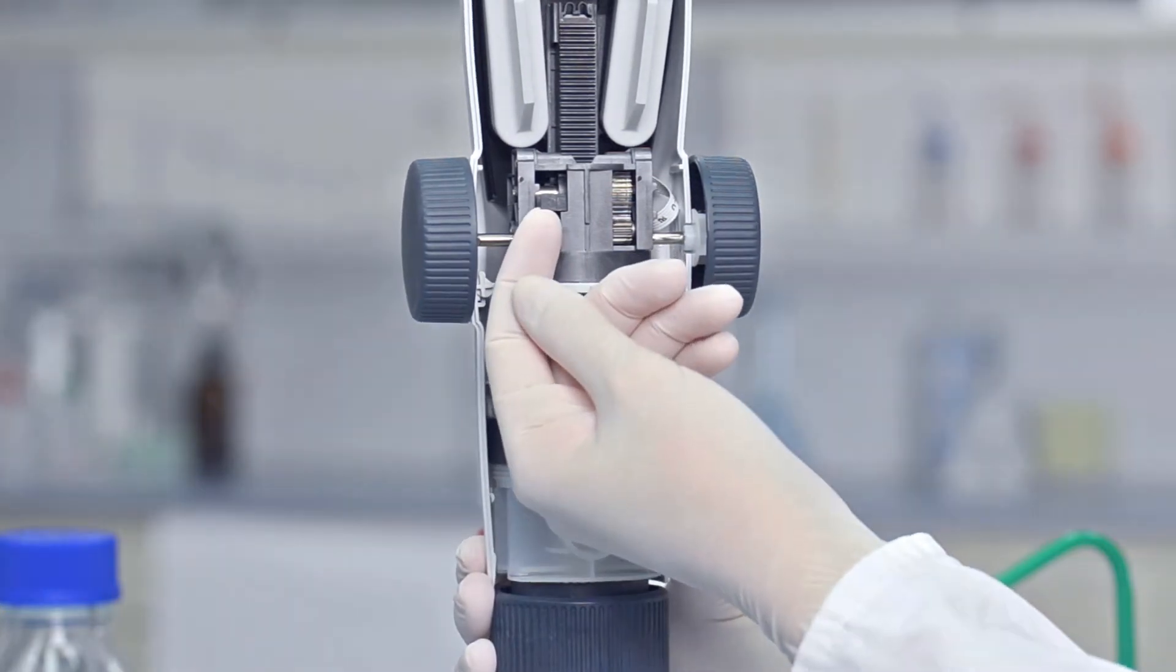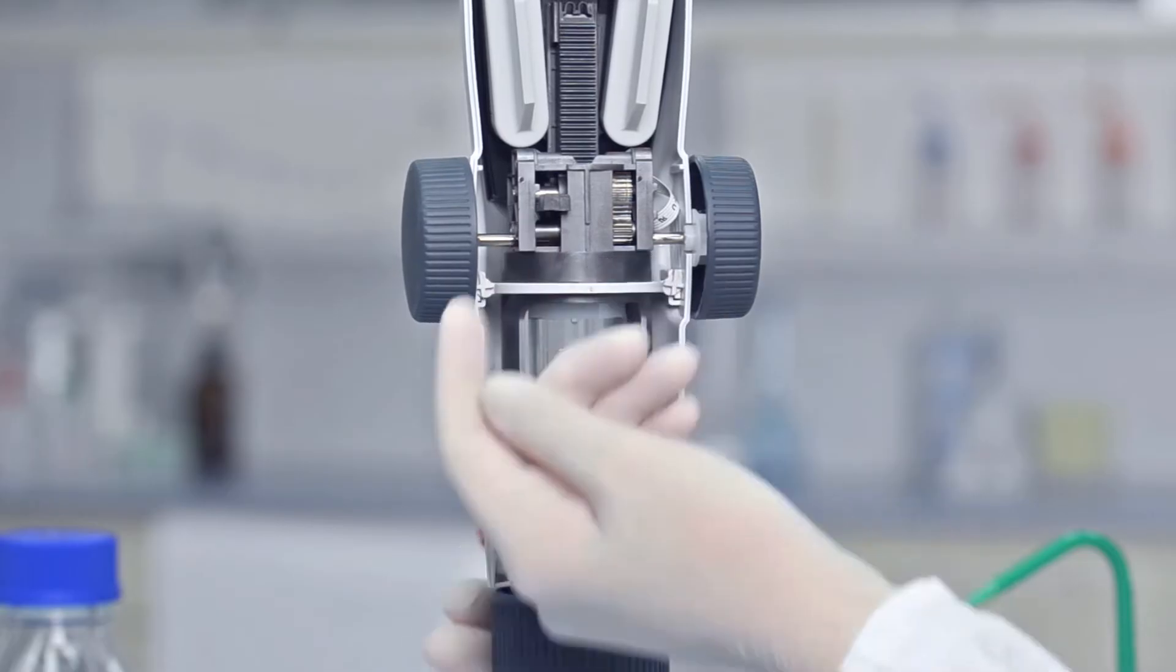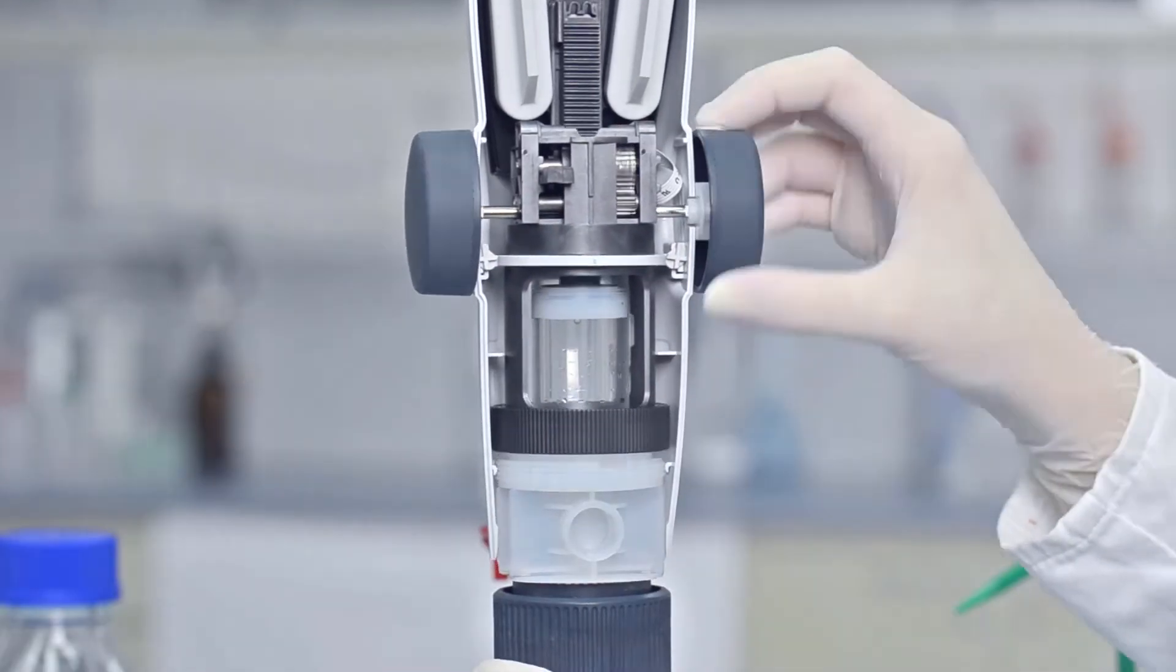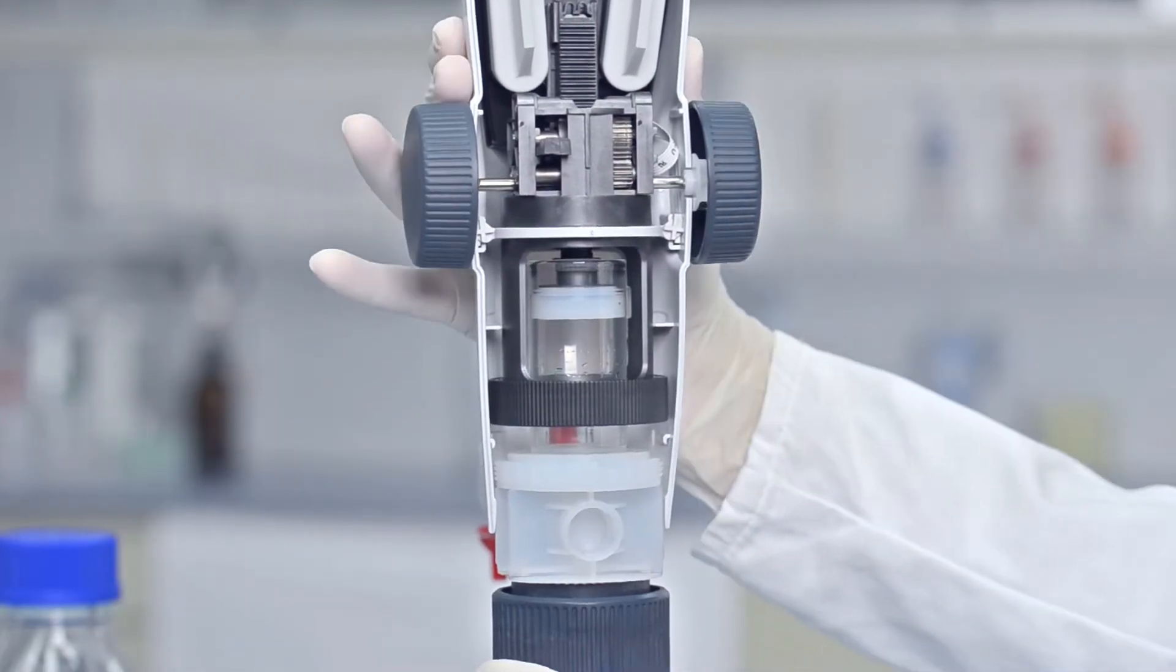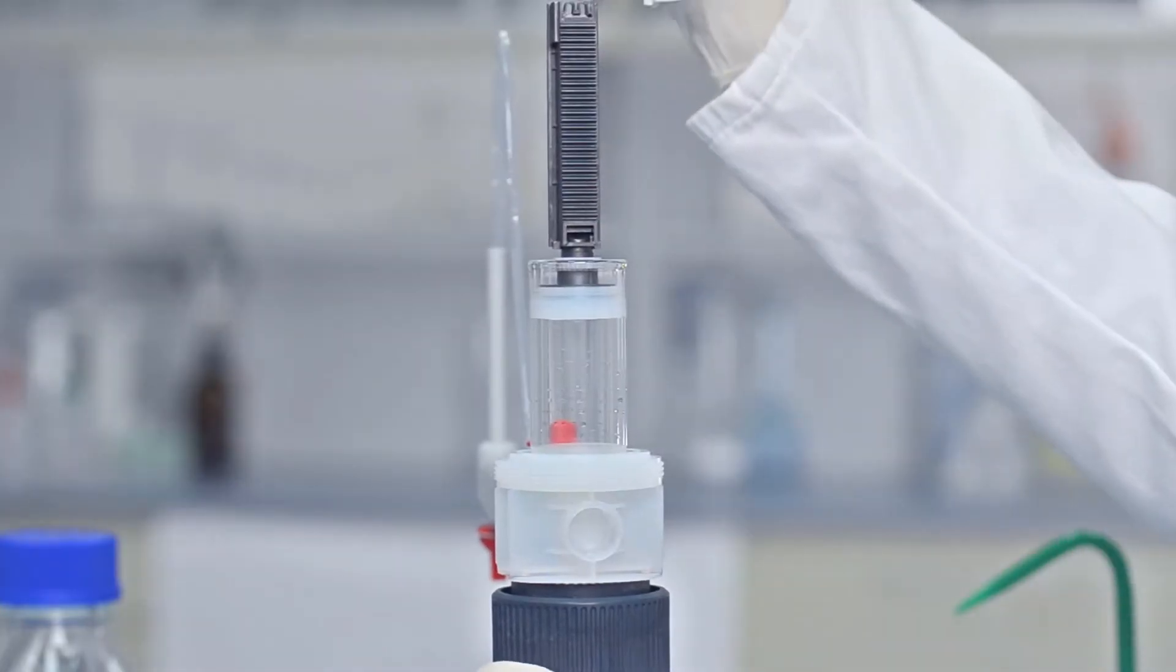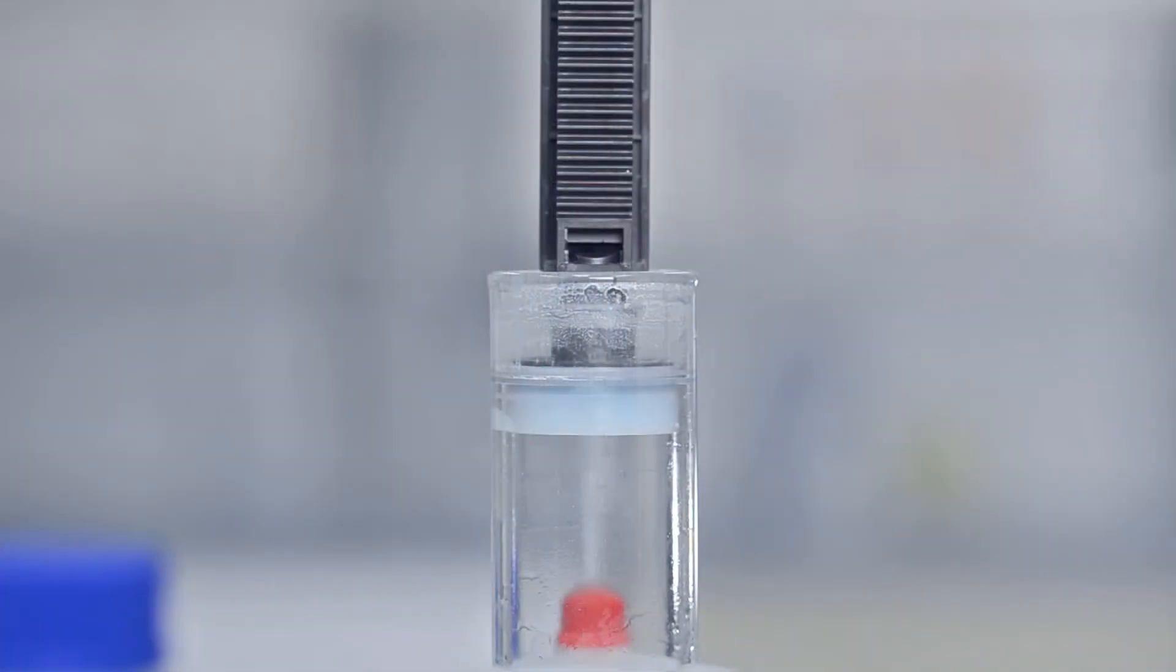Slide out the piston rod locking mechanism to the stop. Turn the hand wheels to raise the top part of the instrument and remove it.